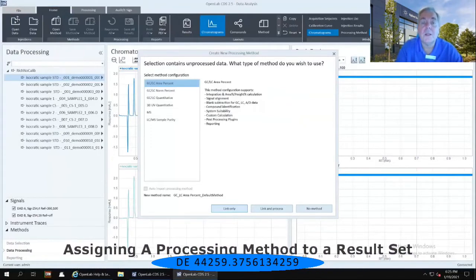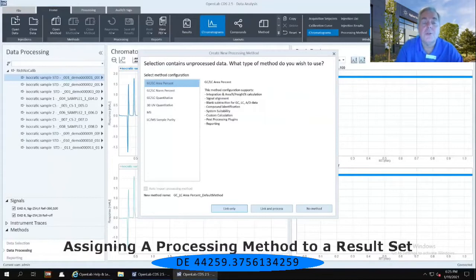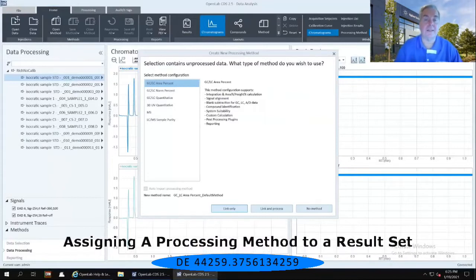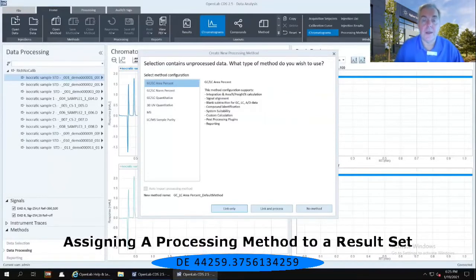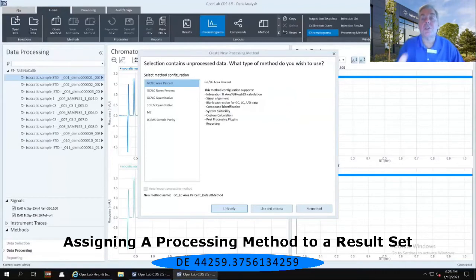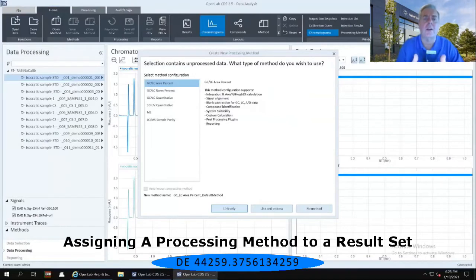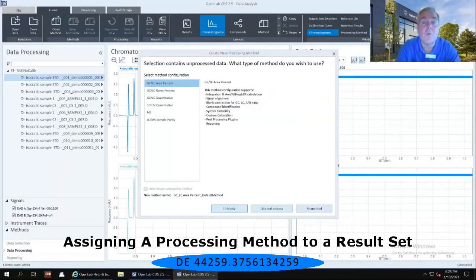It allows you to take one of the default methods available in the system and associate that with your data as a starting point for analyzing your data. Now, you have to know a little bit about what you're going to want to do with the data.